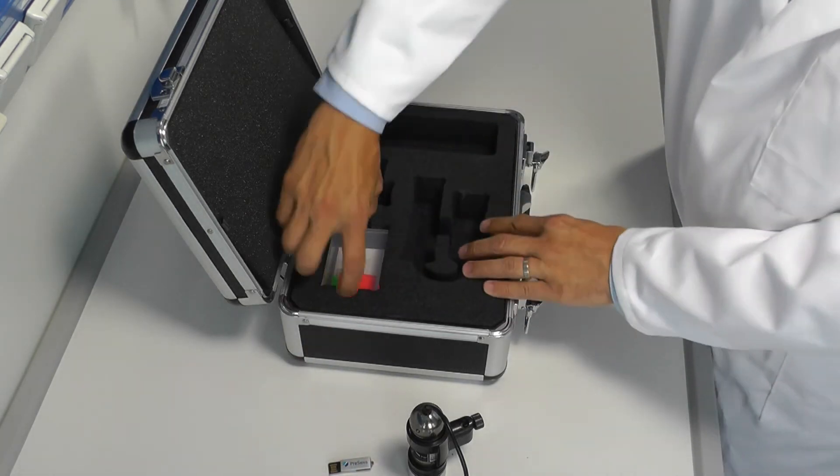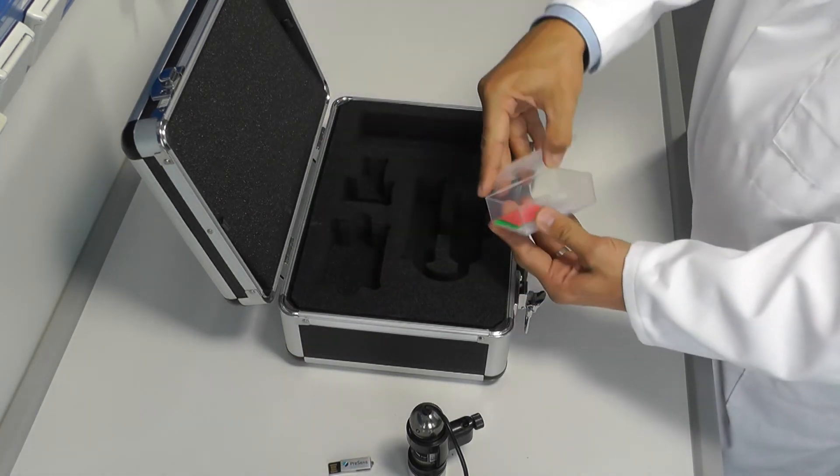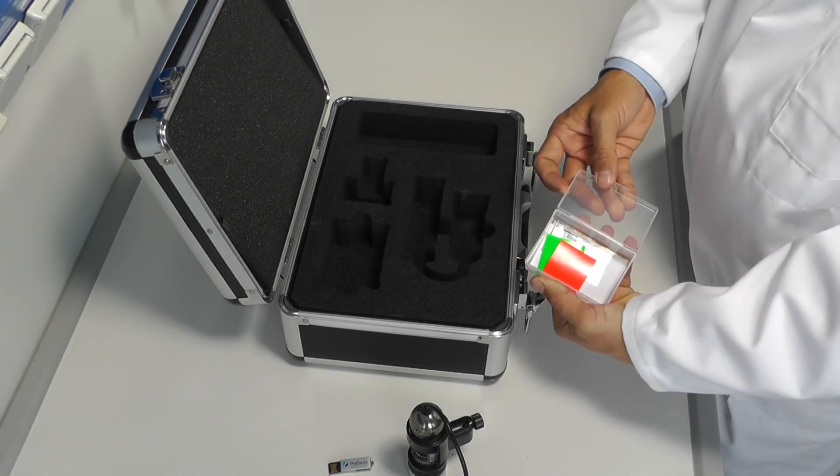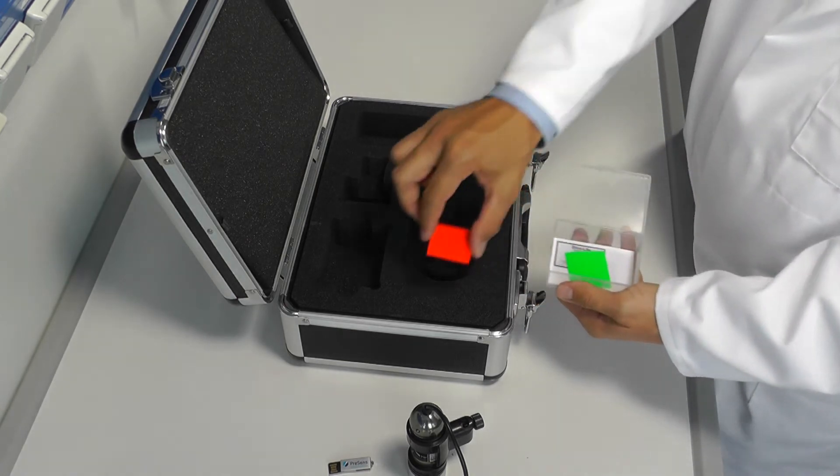A plastic box holds the smaller parts of the equipment. There are two fluorescent reference foils in red and green. These foils are not sensors.